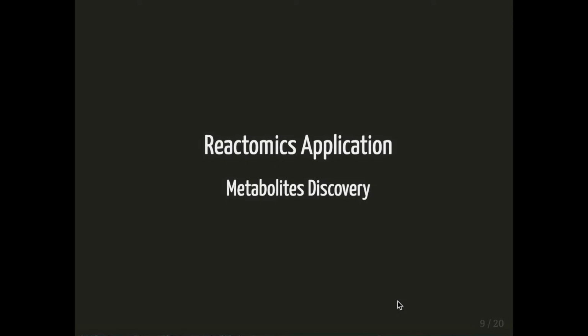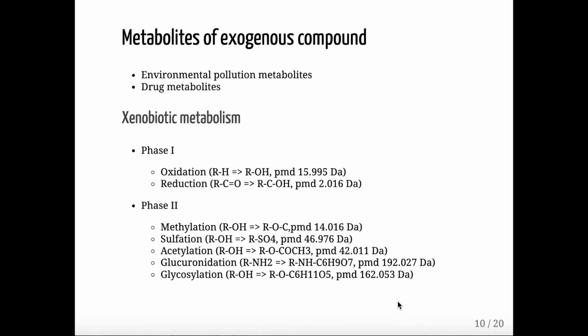As we have the method for qualitative and quantitative analysis of reactions or PMDs, let's see some applications. First one is metabolite discovery. Metabolite discovery usually happens in two kinds of research. One is environmental pollutant metabolite discovery, another is drug metabolite discovery.